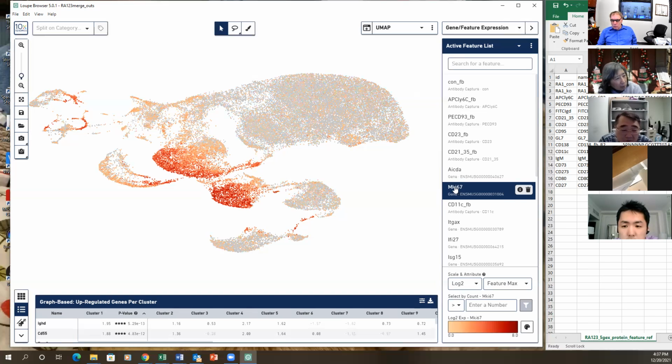Previously, in the single cell experiment, we didn't have that many GC cells. I believe that's the reason. And actually, this time we still have a lot of the FOB cells, but we still don't have that many. Oh, that's right, that's why it's so big, right?